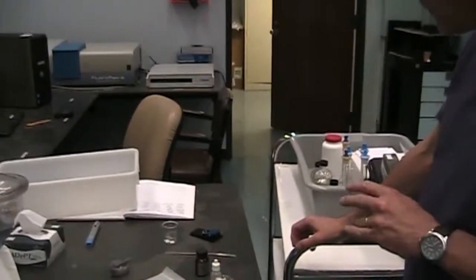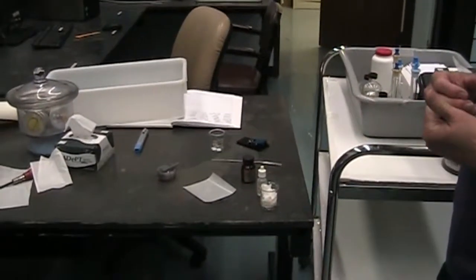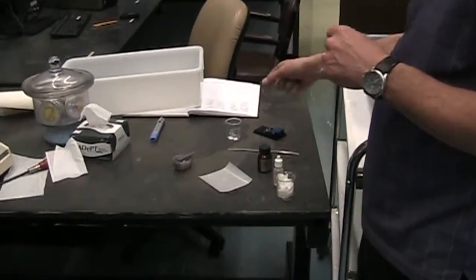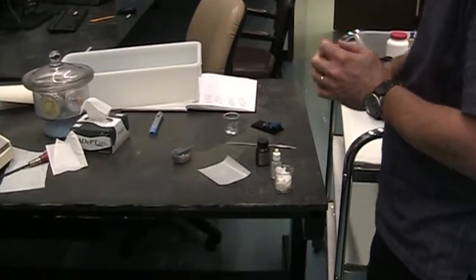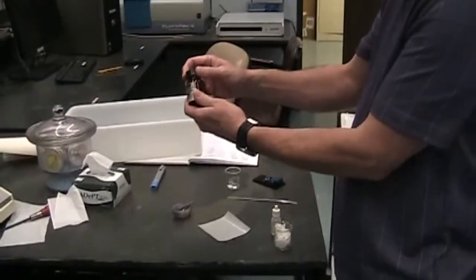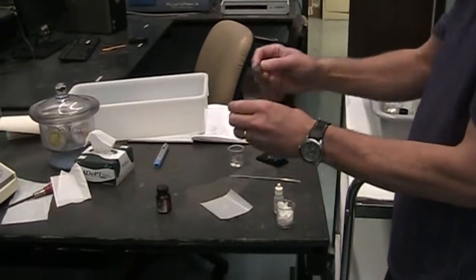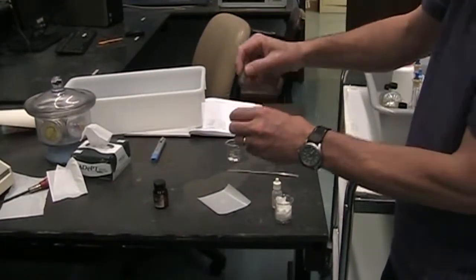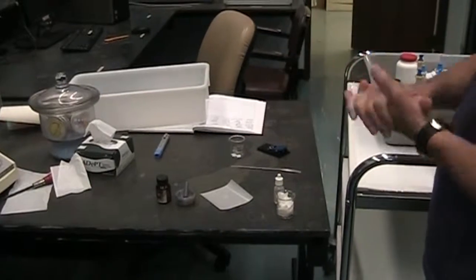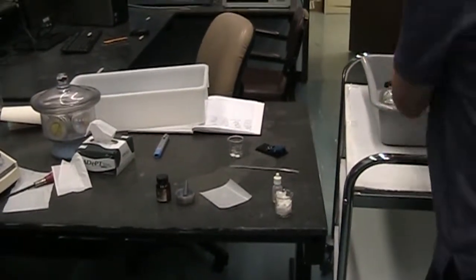So just a few more words on sample preparation, which is often the most time-consuming part of obtaining an infrared spectrum. So I showed you a KBr pellet. You will make one, and there'll be directions on how to do that. We have potassium bromide, mortar and pestle, so you'll mix some potassium bromide in your sample. You'll grind it into a fine powder, and then you'll use the pellet press to make a KBr pellet.